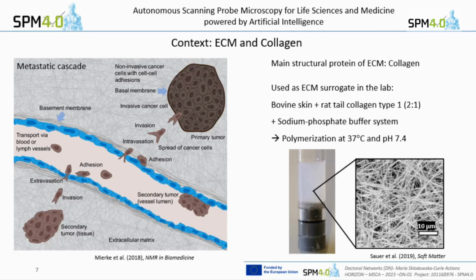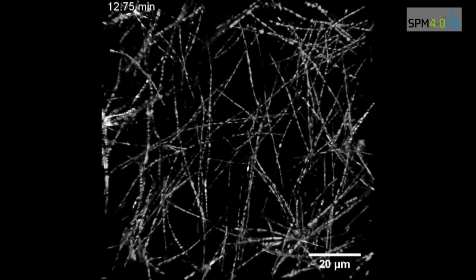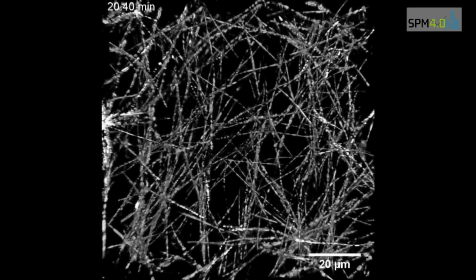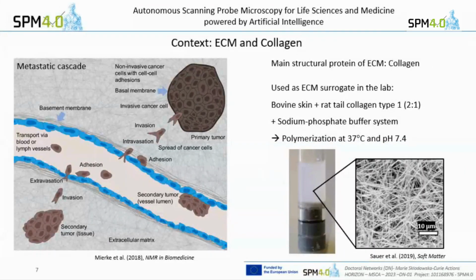And if you zoom in, with this confocal imaging again, you see this structure. And I was also lucky to work with a confocal microscope that has a high-speed scanner, which allows making three-dimensional image stacks in a very short measurement time. And I could capture basically the live polymerization of a collagen gel. This is what you see here. So after a couple of minutes, the network starts to form, and you can see here the buildup of a network. It looks pretty grainy because it was done in this reflection mode I showed you before. Basically, no stains, only scattered light.